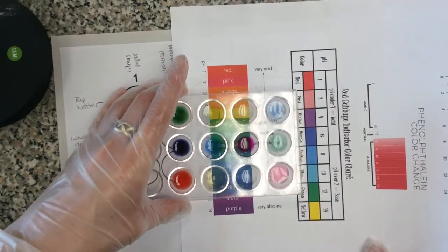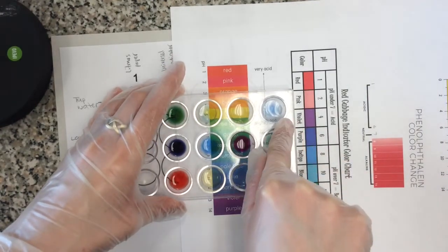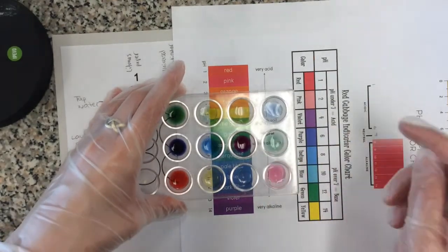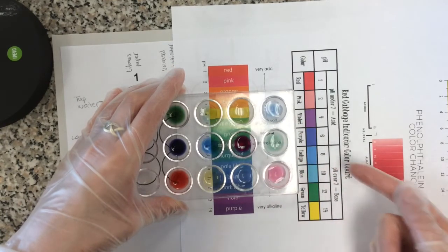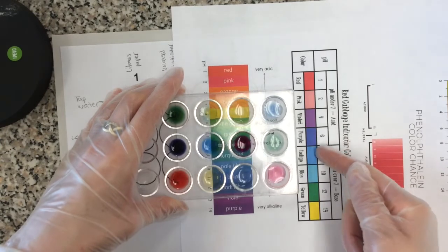these guys right here. Okay, so I have my water, which is a darker purple, or blue, I mean. So I'm going to say it's about indigo. Somewhere between purple and indigo. Okay.